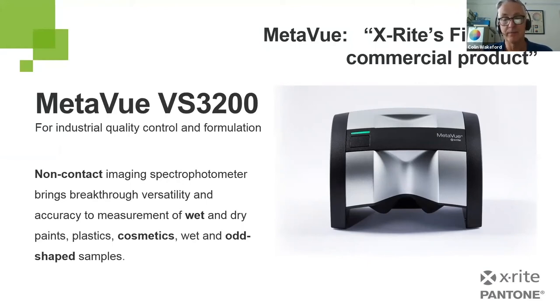Cosmetics. As I always say when I talk about this, I did show my ignorance on cosmetics many years ago when I asked someone at Boots how long it took for lipstick to dry, and I was quickly put right on that. So it's something where you can position a lipstick stick or some powder, which again, if you get in contact with the instrument, is going to make a bit of a mess.